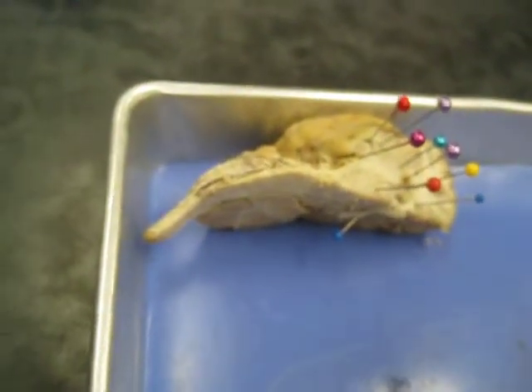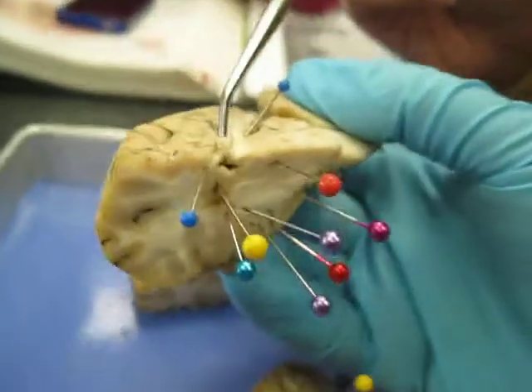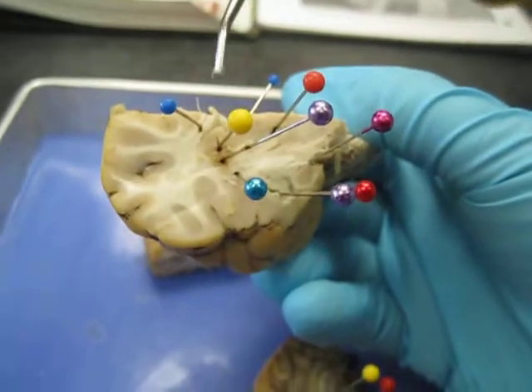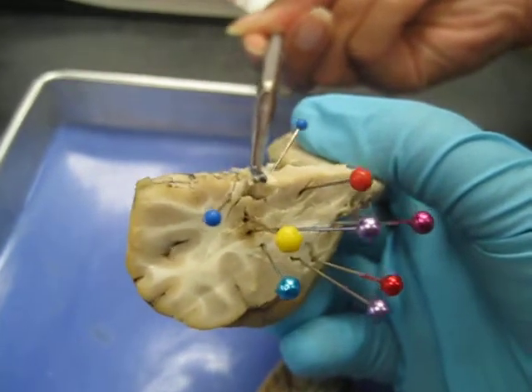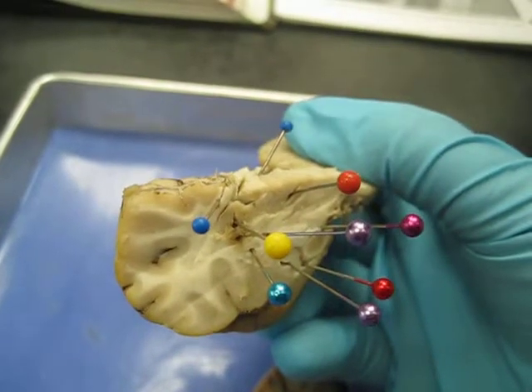Can you hold this up? Sorry. So remember when we were looking at it? So this was the corpus callosum, right? And this is the fornix. So now when you flip it, you still have the corpus callosum, and that's the fornix. Do you see that? Oh, yeah. Then you would have a thin membrane that's covering that lateral ventricle. That would be the septum pellucidum, but it's not shown here.